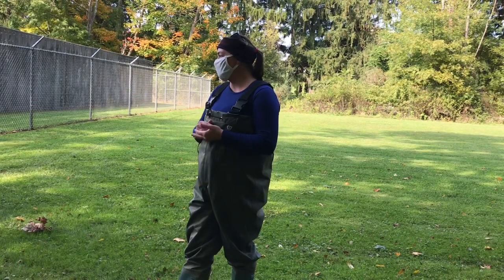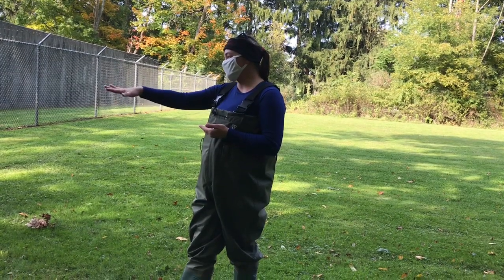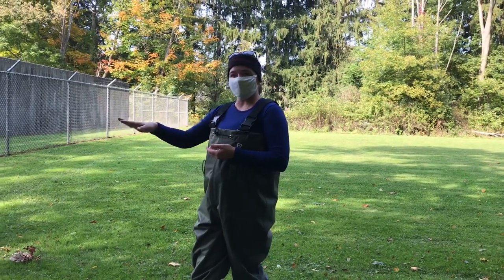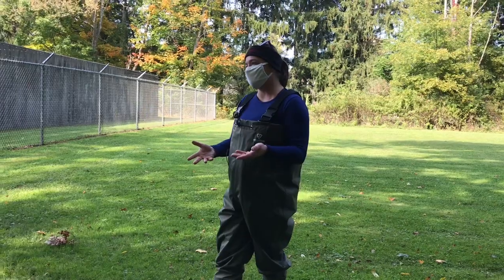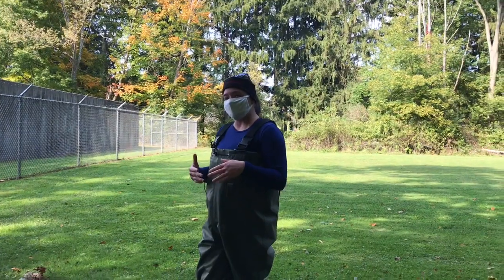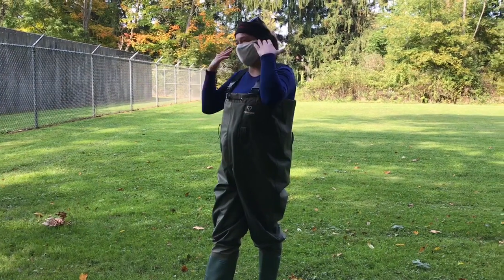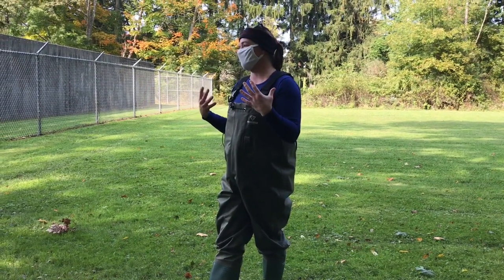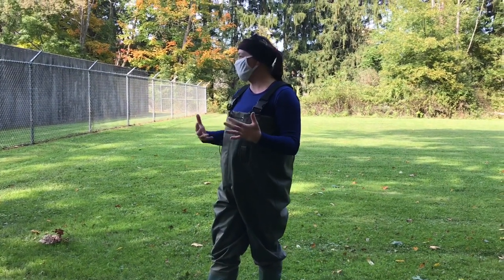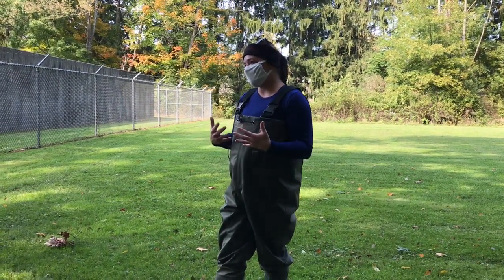So what I have for you is in this pink bin, they're all sanitized, lots of clipboards. There's also some extra pencils in there if you don't have a pencil with you, and some write-in-the-rain paper so that it can get wet and you can still write on it, that you can take notes on, because I'm going to talk about a few things methodology wise, and it depends on your experience and your age and how your brain works, but I know that I forget things very easily, especially when I try to go back and write out a really full description. So it'd be good to take notes today, get that full description down on paper.